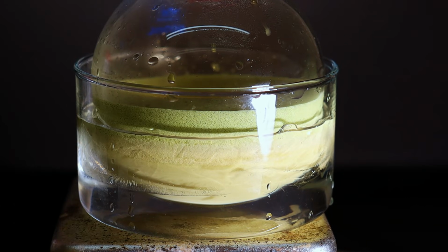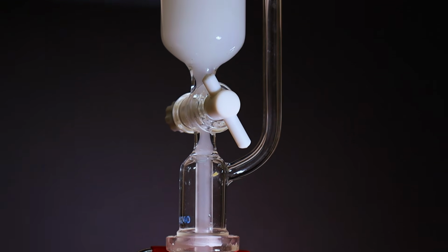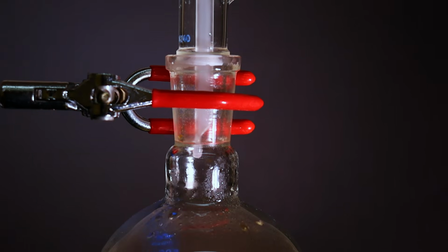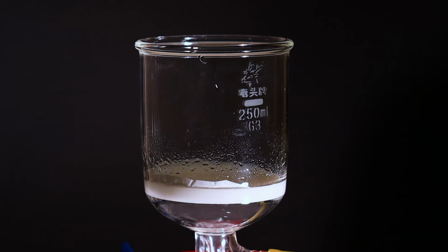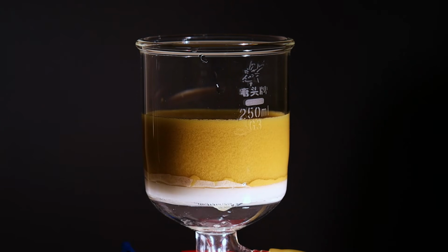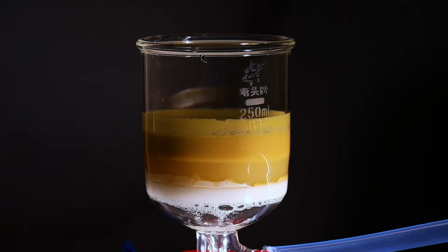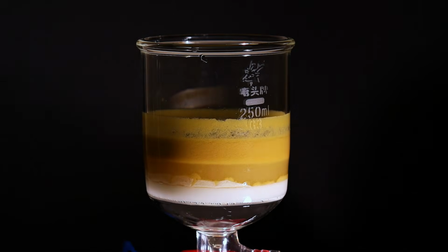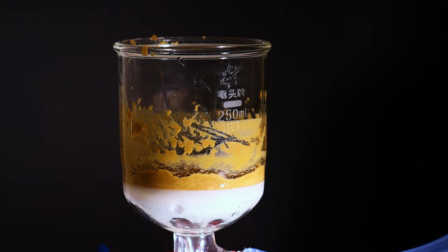And once everything has been added, it had to yet again be left for half an hour to ensure complete reaction. With that out of the way, the last step was to just filter and collect it. I quickly set things up for a vacuum filtration and filtered the product. That is really it for the purification, as the product reacts with a lot of common lab solvents, and they are not suited for this situation. I really need the product to be somewhat pure, so this is okay.